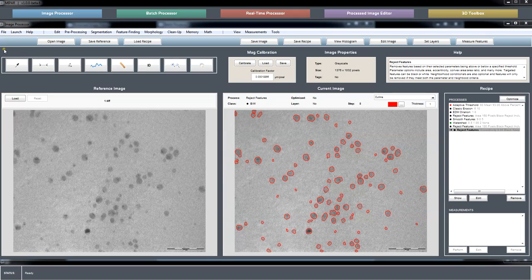Yes, and you had sent me a couple of images, Meg, that I think could pertain to some of the other topics folks wanted to cover. The top 4, I still have region-specific thresholding from Johan that many voted on, and batch processing of different images. And I want to get to those.